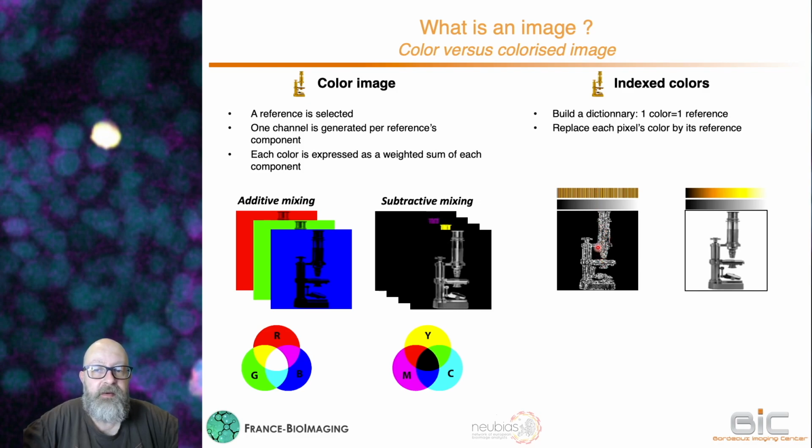So you see, instead of having 3 different layers, each one being a bit, you could use what is called an indexed color image, where you have some indications on how to color, and the dictionary of colors associated to it. In terms of memory on the computer, it will be smaller than a pure color image.